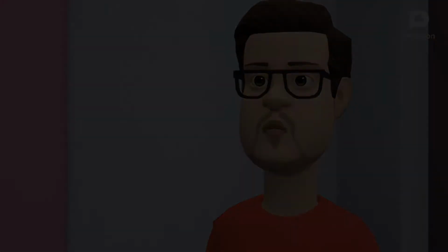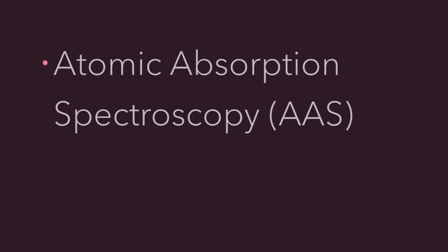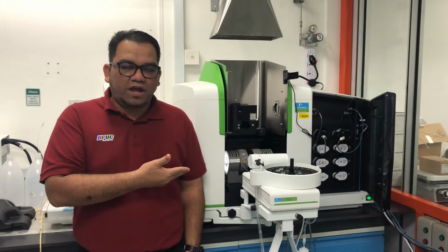Let's go. Okay, Assalamualaikum and hi everyone. So we have learned about the spectroscopy instruments, right? For the spectroscopy methods, we have several instruments as I taught in the class. The first one is AAS. So this is AAS, atomic absorption spectrophotometer, and then we have AES.